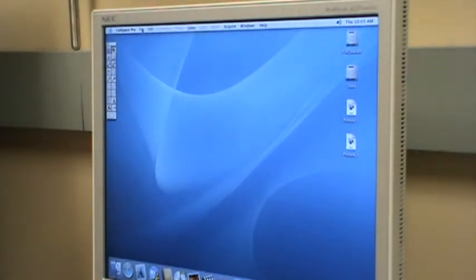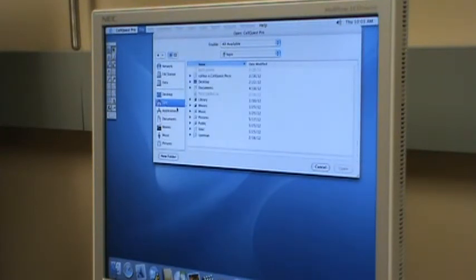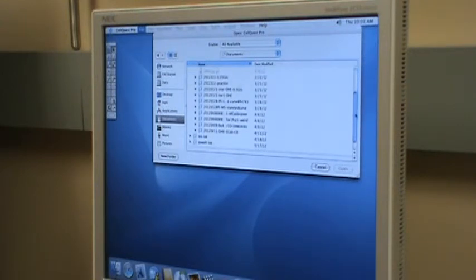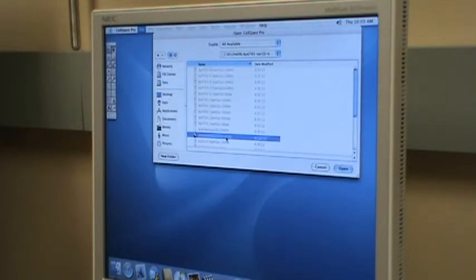So I'm going to go to File, Open Document, and then I will go to my document, my own directory, HQIN, and then I go to Document. Usually you have to find the lab, and you find the most recent template. So in our case, I'm going to find it, it looks like Apple 9. This one, template.